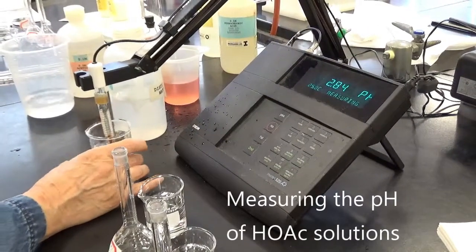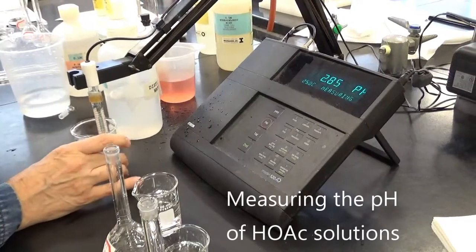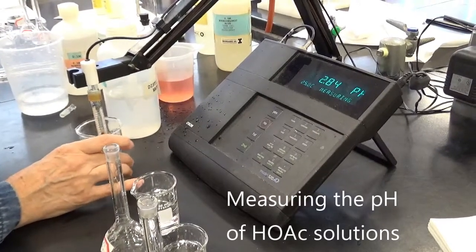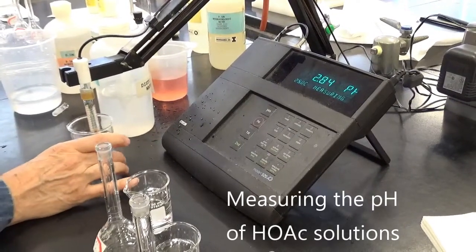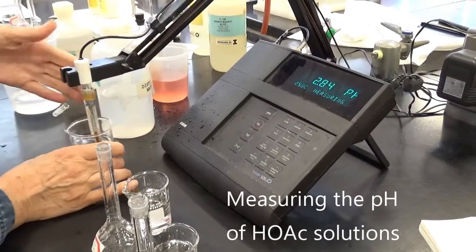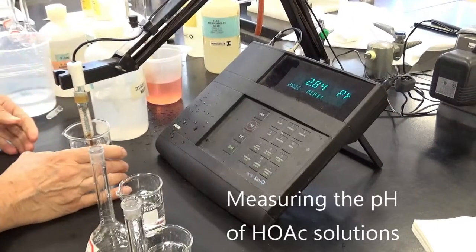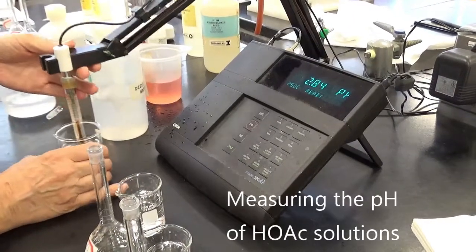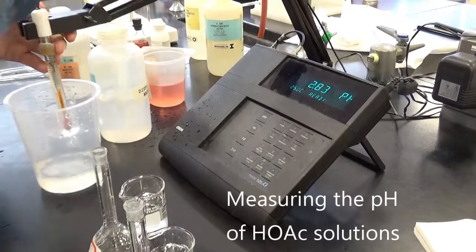Do you remember what this reading was for the 0.10 molar HCl? If you remember, it was 1.00. This is 2.84. So what does that say about acetic acid at the same concentration as HCl? Is it more acidic or less acidic? 2.84. Write that on the data sheet. Okay, now I gotta rinse again.